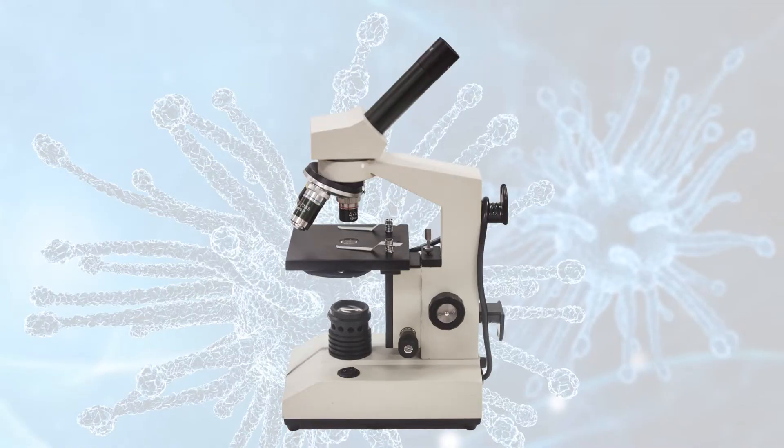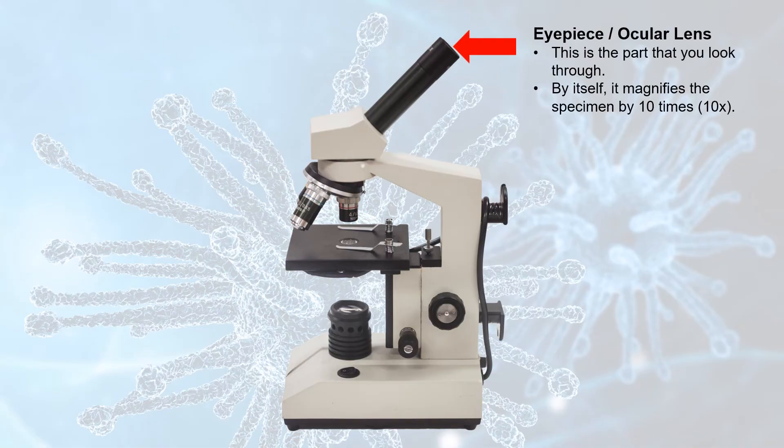In order to properly use the microscopes in our lab at school, you need to know the names and functions of the different parts. Let's start out with the eyepiece, also known as the ocular lens. This is the part of the microscope that you look through. By itself, it also makes the specimen look bigger, having a magnification of ten times. In other words, just looking at the specimen through the ocular lens alone would make it look ten times bigger than it actually is in real life.